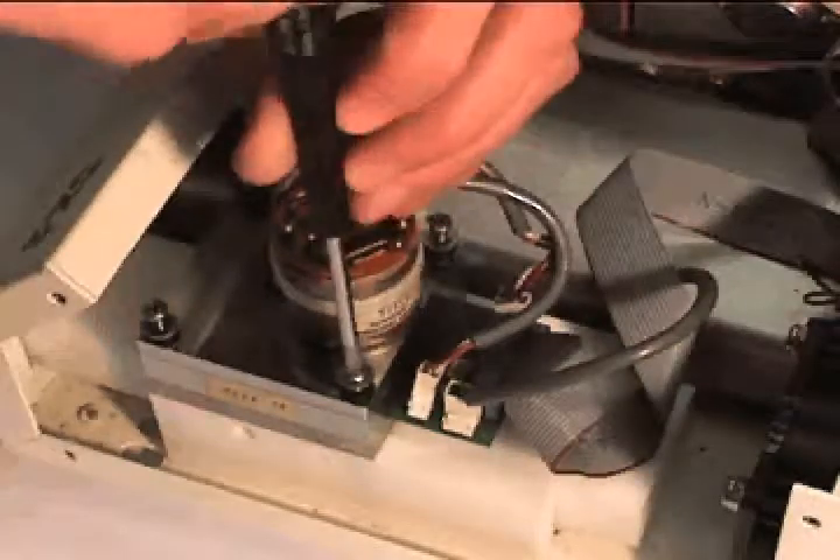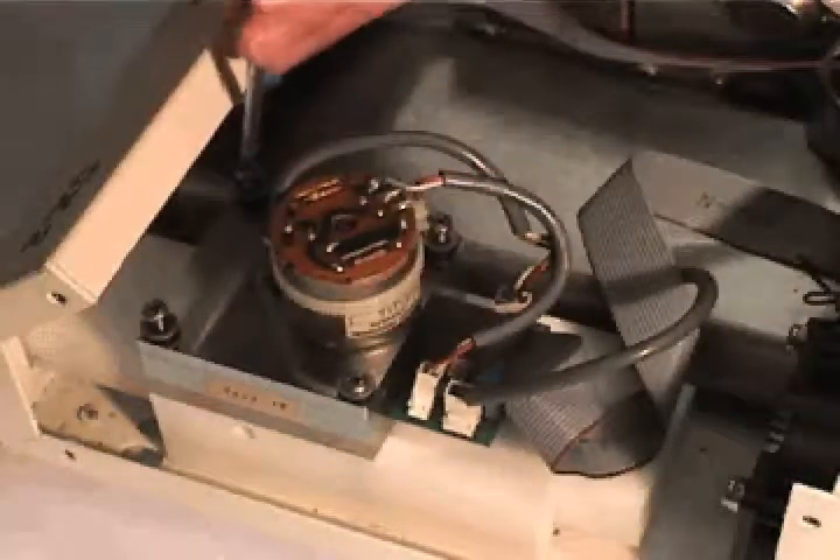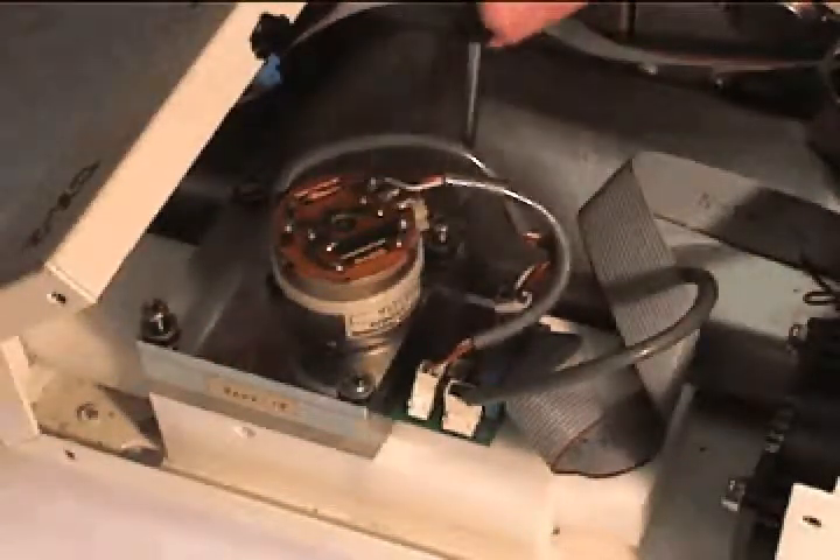Finally, reassemble the sensor block on the drawer base. Tighten the four screws, making sure not to put too much pressure on the rubber O-rings. They need to be tight, but not too tight.